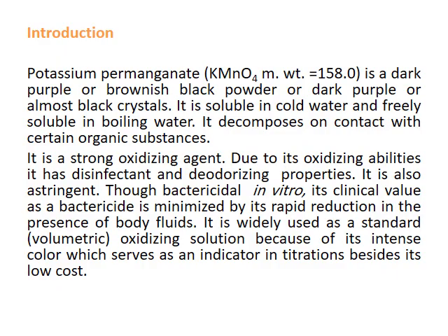KMnO4 is a dark purple or black powder or crystals. It is soluble in cold water and freely soluble in boiling water. It undergoes decomposition on contact with certain organics. KMnO4 is considered a strong oxidizing agent, and this imparts a bactericidal activity.